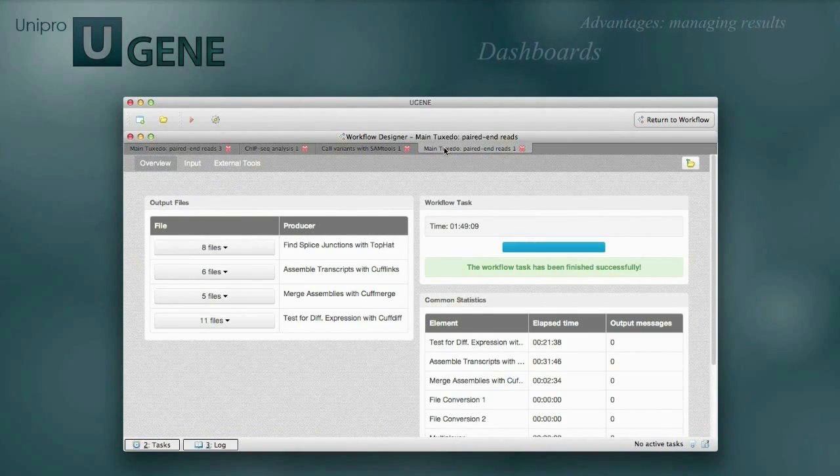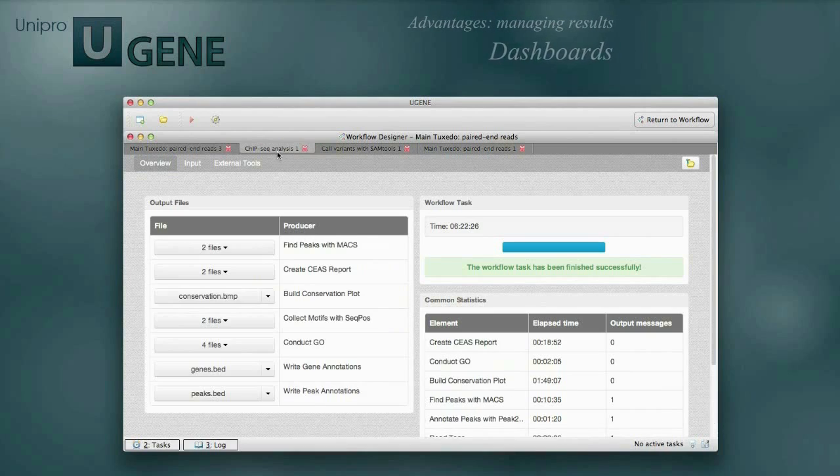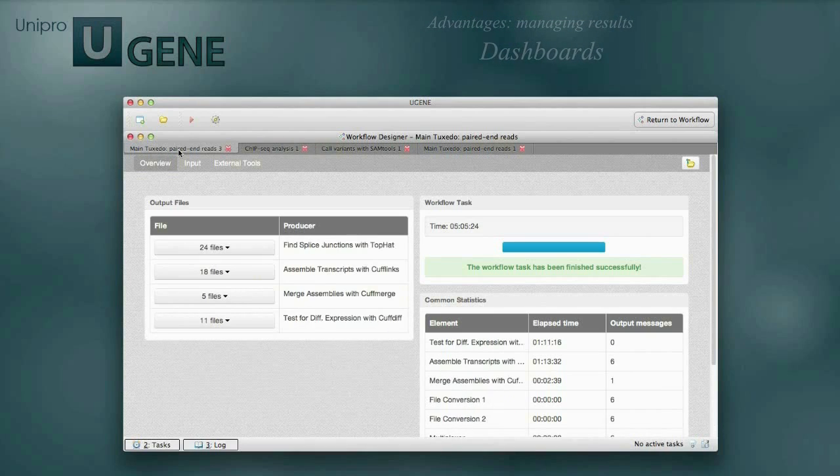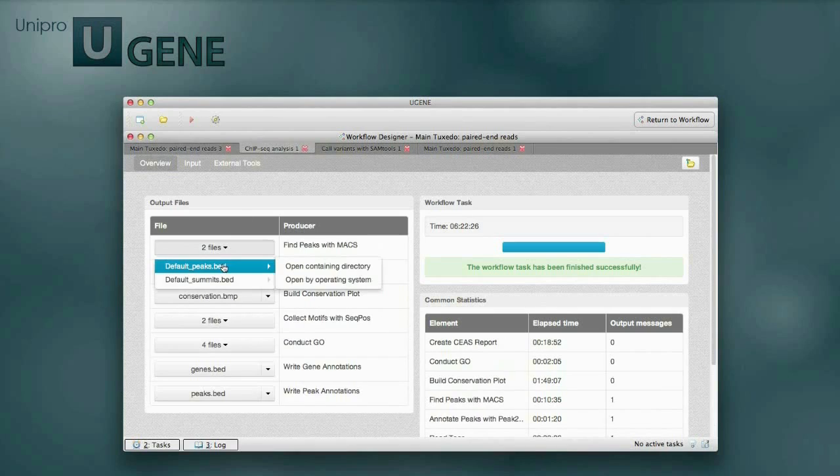The dashboards are saved between launches of the UGENE application, so you can see information about previous runs, check the input parameters of a run, and open the produced files.